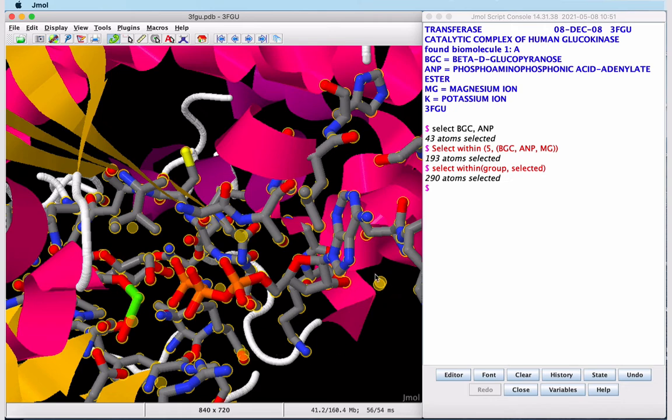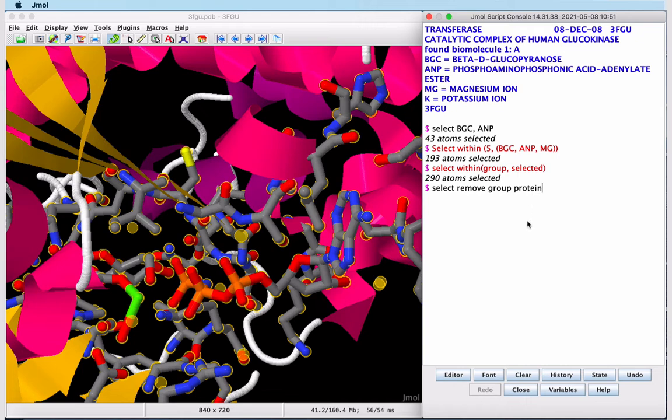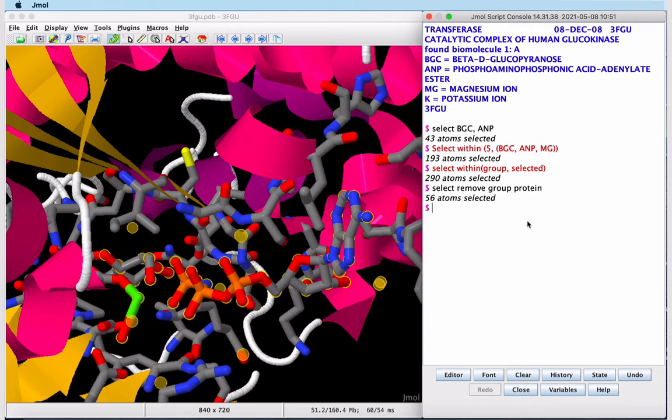However, we'll notice we have these halos for unselected atoms. These are our water molecules. We'd like to show these as spheres, so let's remove our ligands and the protein from the selection. This command will remove the protein from the selection, and now we want to remove the ligands, which are heteroatoms.